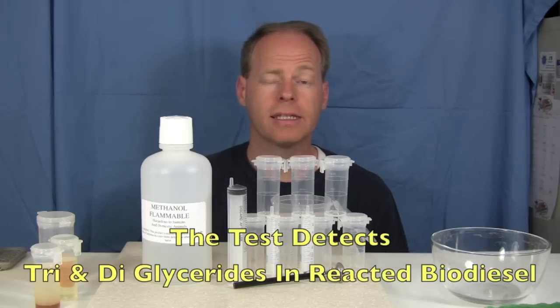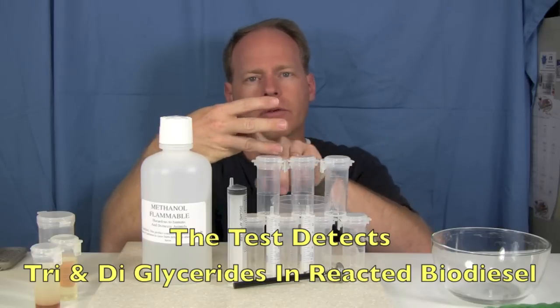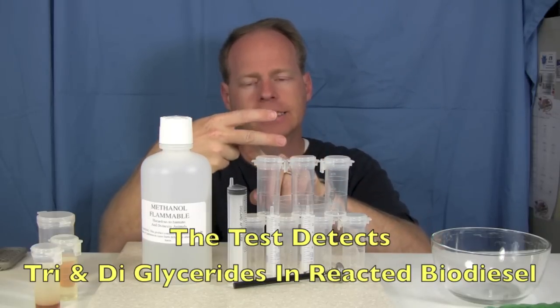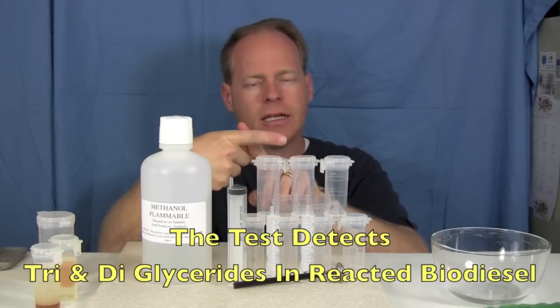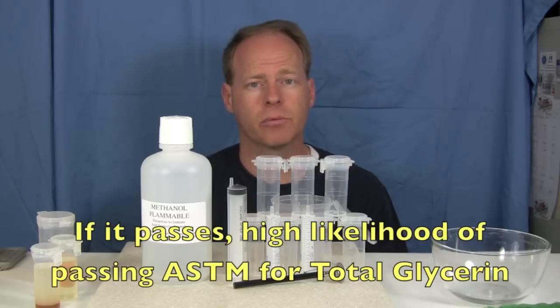We found out that the test measures what are called triglycerides and diglycerides — in other words, portions of the oil where all three fatty acid chains are still attached, or two fatty acid chains are still attached. They found that it's not terribly accurate at measuring monoglycerides, but for the tri- and the di-glycerides it was very accurate. If you pass this test and do it properly, there's a good chance that you'll pass the total glycerin test in a lab.